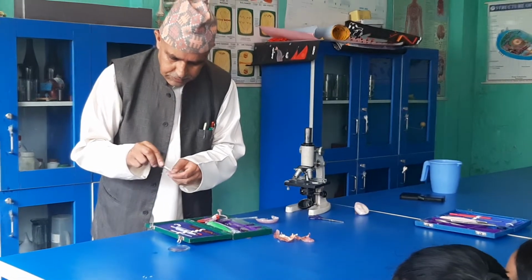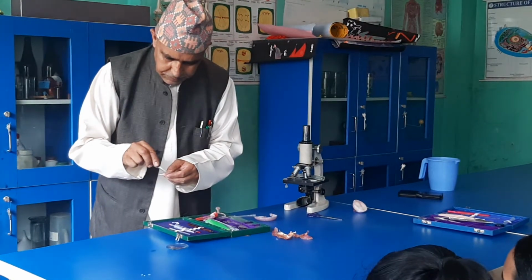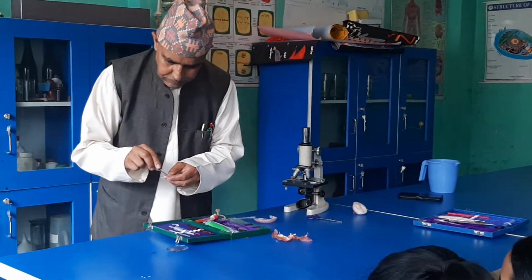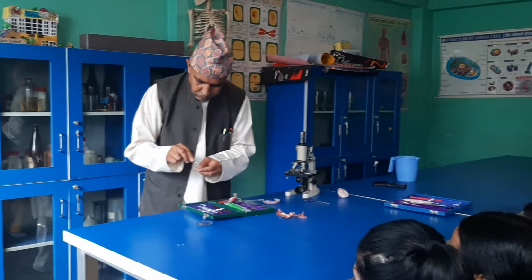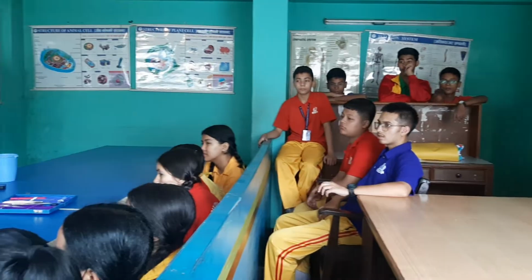If it is kept in double or triple layer, then it will be difficult to see the cells. A small piece is also enough for us to view. Let me keep 2-3, okay? So from any, you can just notice.